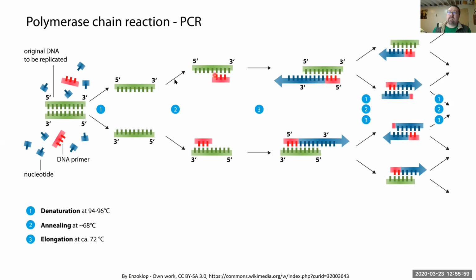And this is basically coming down off the 90 degrees. Everything's in this stew or soup. And then as it gets cooler, they're getting slow enough to actually start binding with a complement. So the DNA is binding by the complement here. So it binds, it anneals. Now you have that start of the railroad track for the DNA polymerase to sit down.